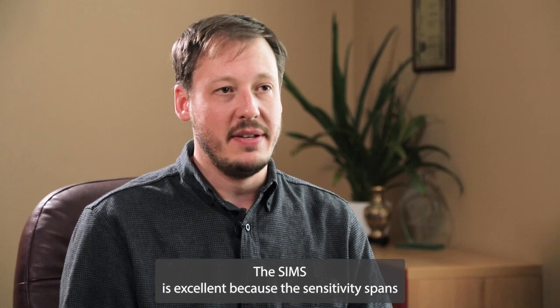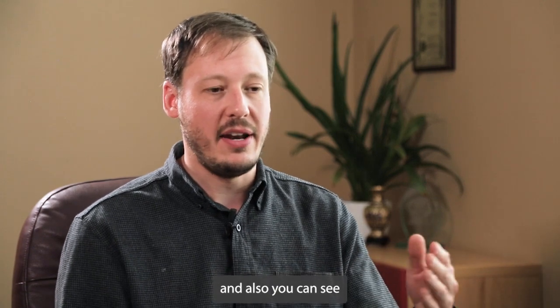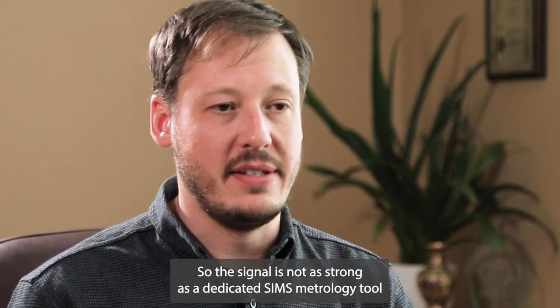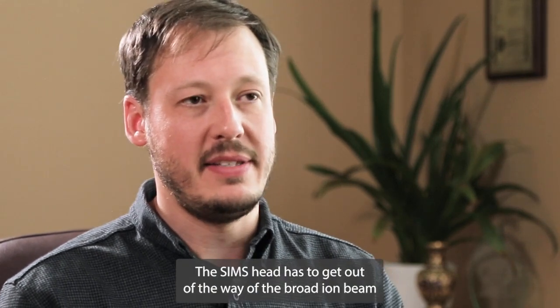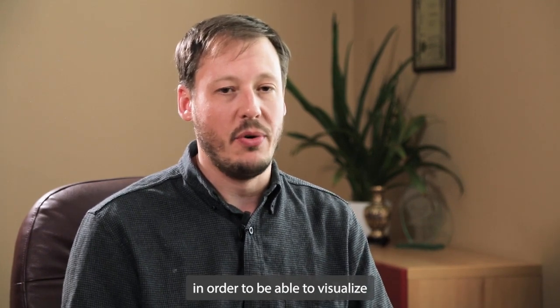The SIMS is excellent because the sensitivity spans 7 orders of magnitude. That means you can simultaneously measure the signal of the very thick copper layers of the interconnects, and also you can see very low signals such as the thin barrier layers. So the signal is not as strong as a dedicated SIMS metrology tool because the geometry is not quite optimized. The SIMS head has to get out of the way of the broad ion beam and also to protect the internals of the SIMS from the etch products. But the sensitivity is still there in order to be able to visualize the signal from these barrier layers.